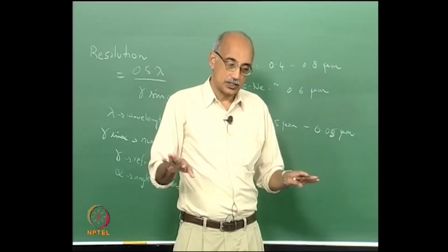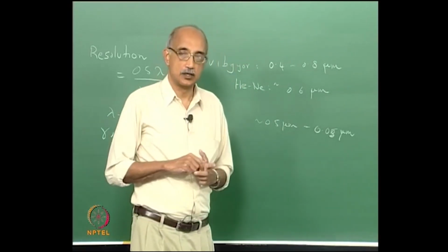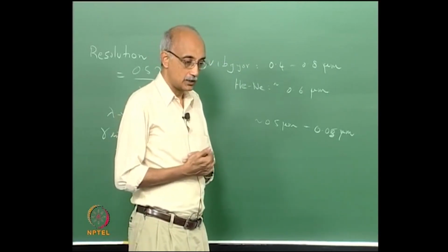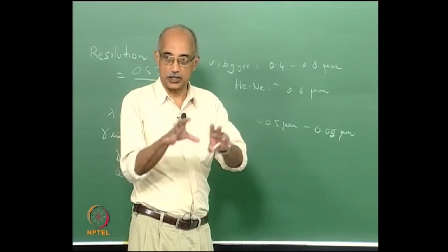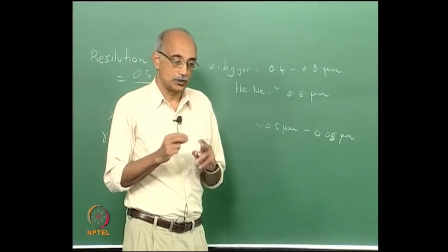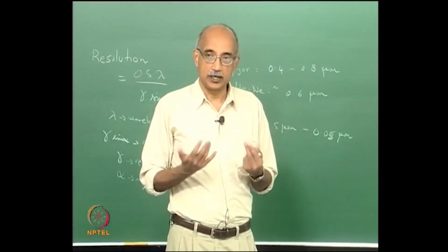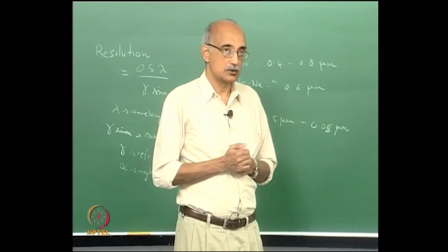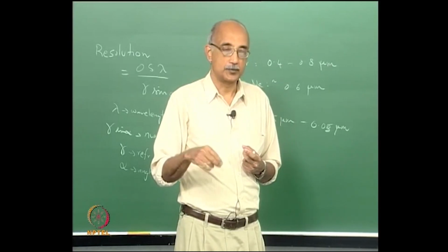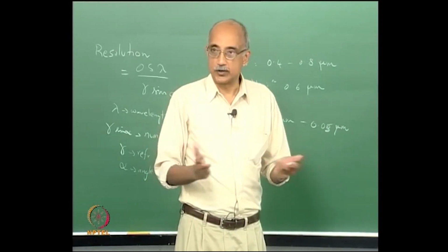There is another way in which you can distinguish microscopic techniques. When you have a large flat surface and you are trying to do microscopic analysis of the surface, you can either initially capture an image of the entire surface and then use software to do your scanning. So for example, you would capture this image of this tabletop in a camera or some kind of a CCD, and then use various algorithms to analyze the image and obtain the information that you are seeking. This is basically called the imaging mode of analysis.